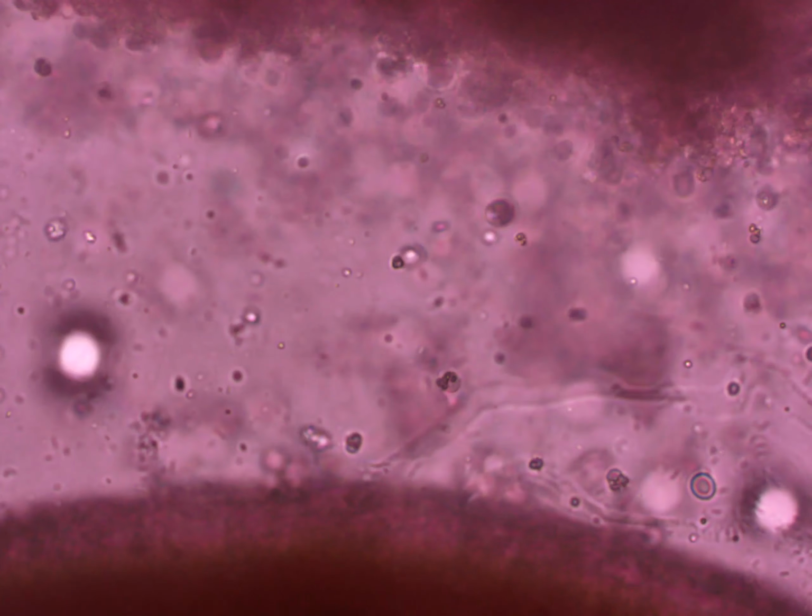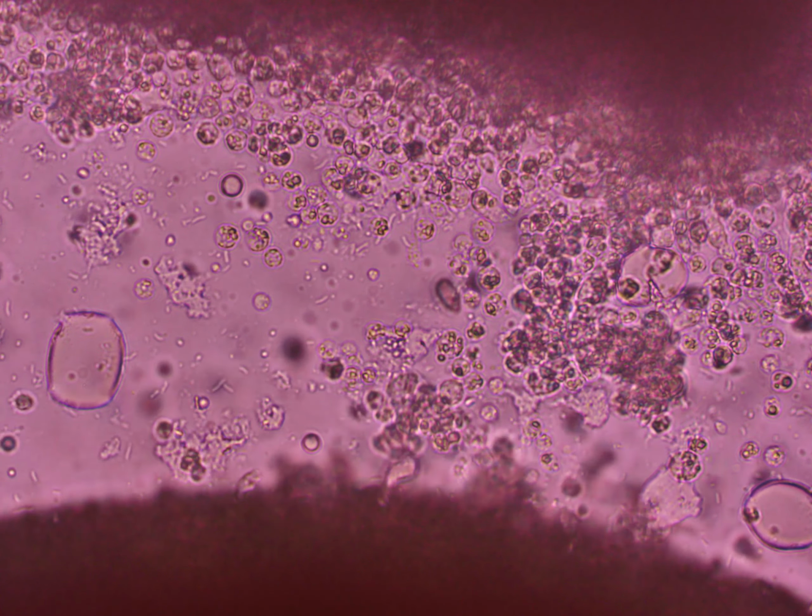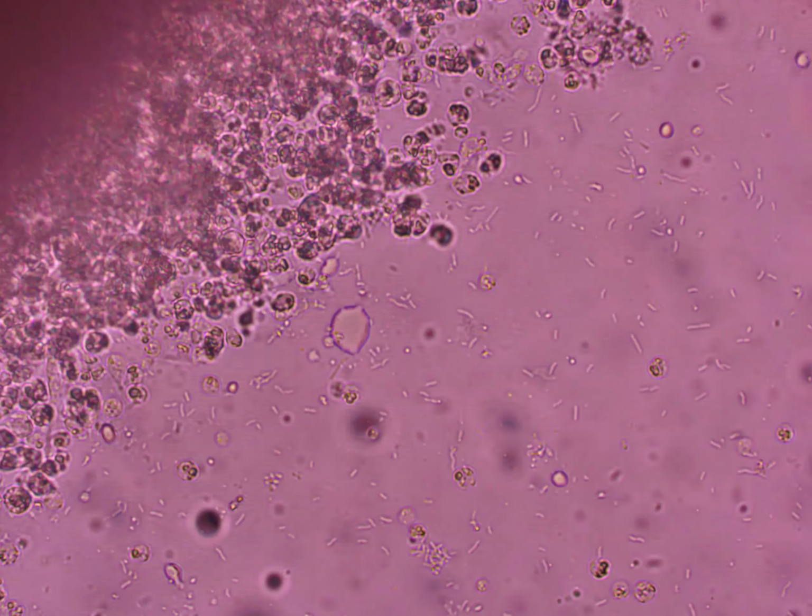And here's what's inside the eggs that they're looking for. And look at that buildup on the other egg. I think they've already broken up the shell. This was almost a puffier one, so I think they've already broken away that casing on this egg.